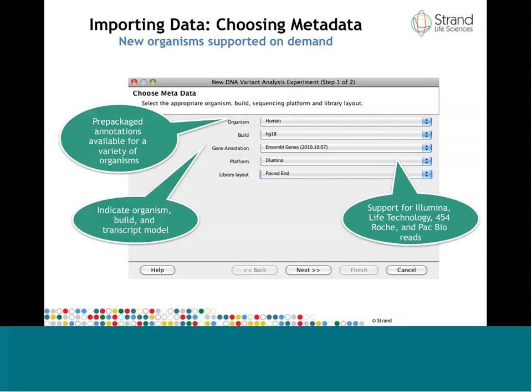Once you specify the organism and the build and the transcript model, you have to choose the platform type, which is either Illumina, Life Technologies SOLiD, 454 Roche, or PacBio. We also have support, very recently released, for the Ion Torrent platform as well.